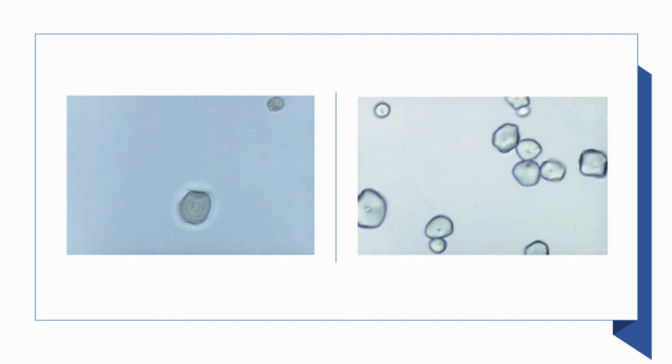So here are some examples of artifacts. On the left, you have this rounded structure with concentric circles representing a pollen grain. On the right, you see highly refractile spheres with a dimpled center representing starch granules, which come from the cornstarch or cornstarch powder used in powdered gloves that may be used by the laboratory personnel doing the microscopic examination. They can resemble fat droplets, or they can also be confused with red blood cells.